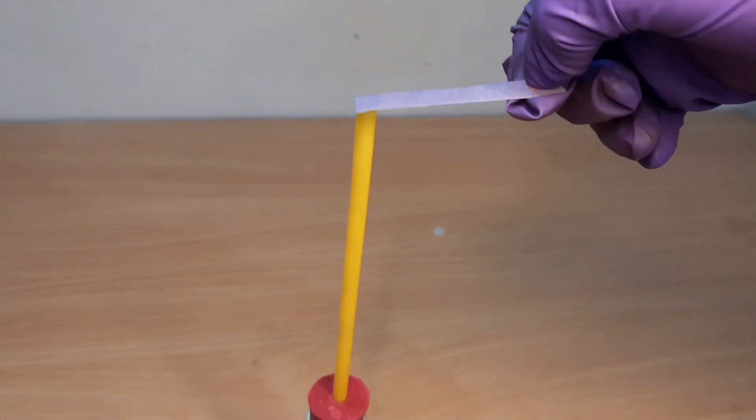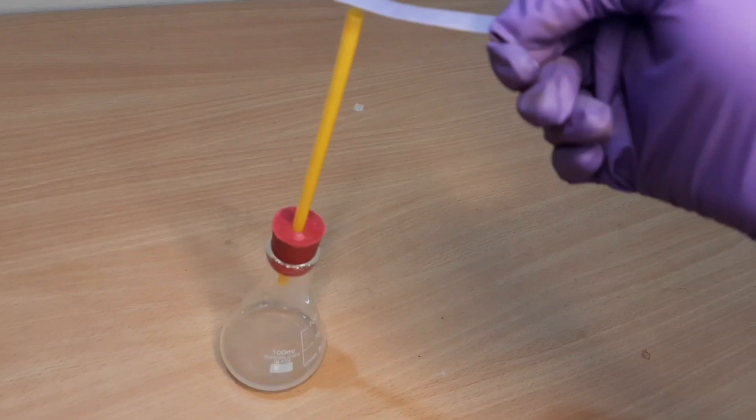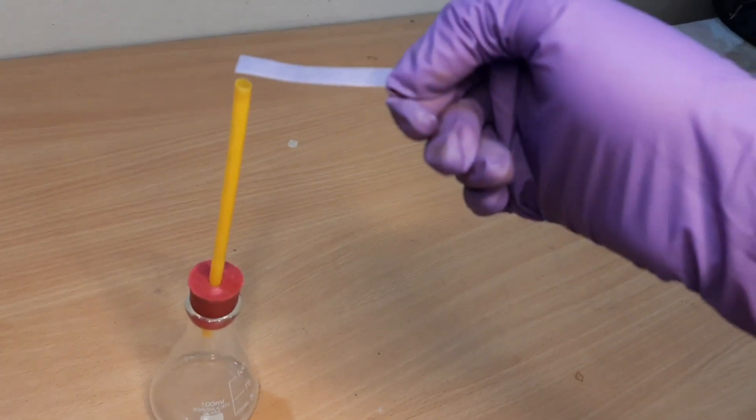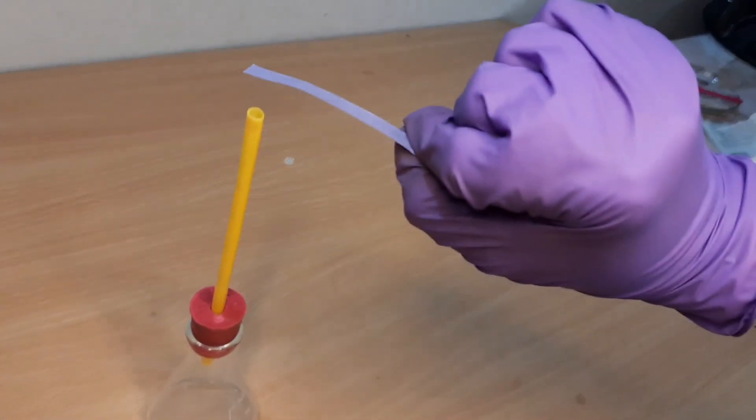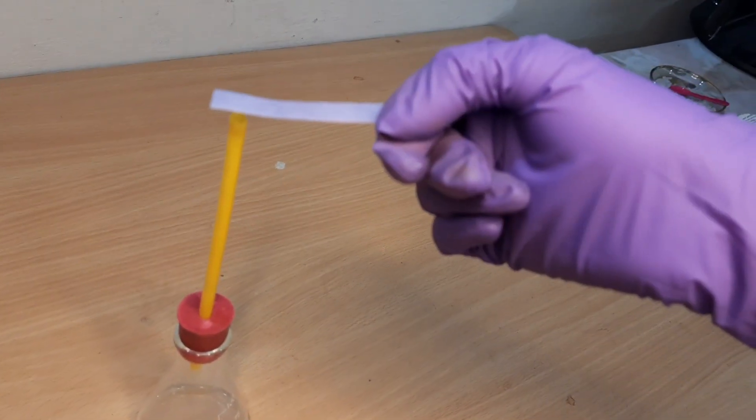Hold the dry blue litmus paper in hydrogen chloride gas. There is no change in the color of the dry blue litmus paper. This shows that hydrogen chloride gas does not behave as an acid in the absence of water.